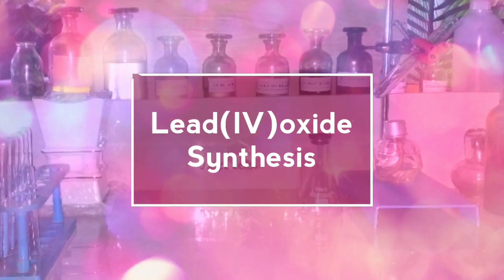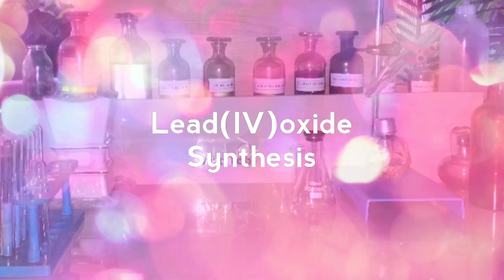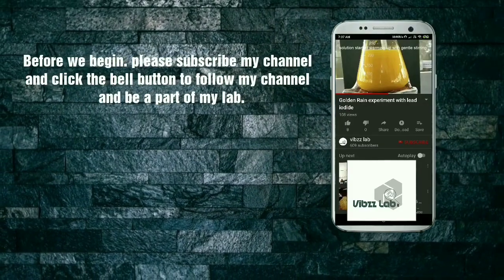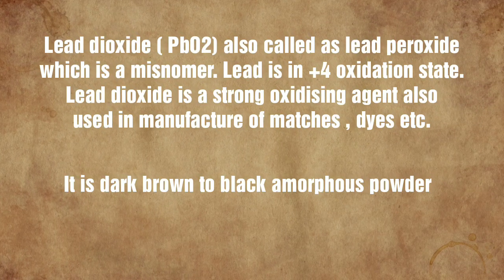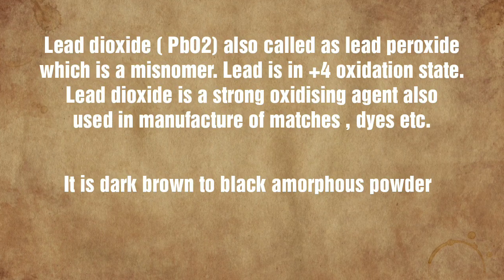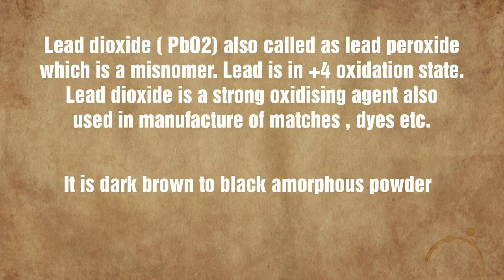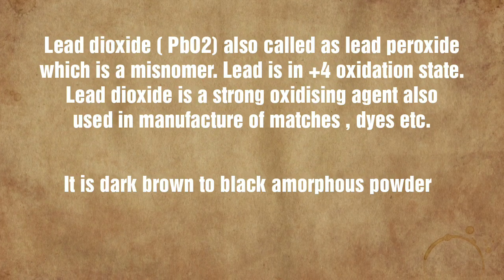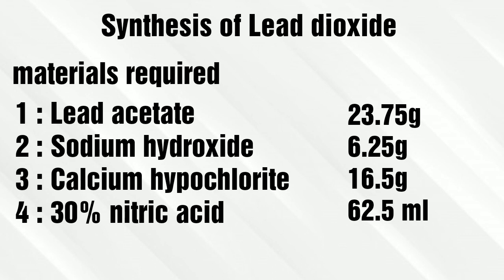Friends, today we would be synthesizing lead 4 oxide or lead dioxide. Lead dioxide, also mistakenly known as lead peroxide, is a very strong oxidizing agent. It is a dark brown to black amorphous powder. For the synthesis of lead dioxide we require lead acetate trihydrate, sodium hydroxide, calcium hypochlorite — that is bleach — and 30% nitric acid.